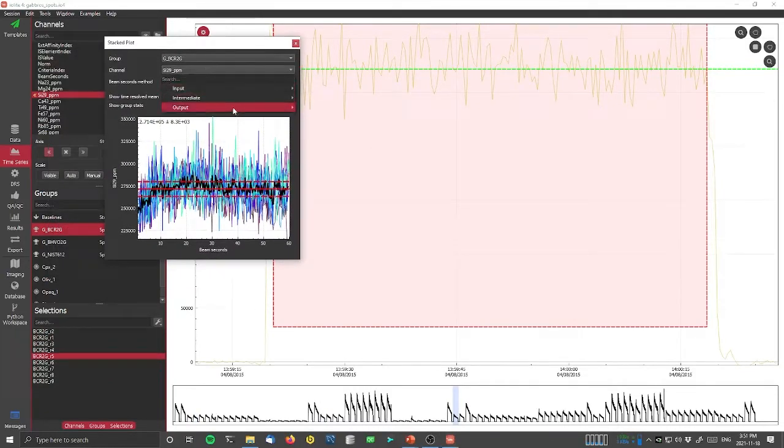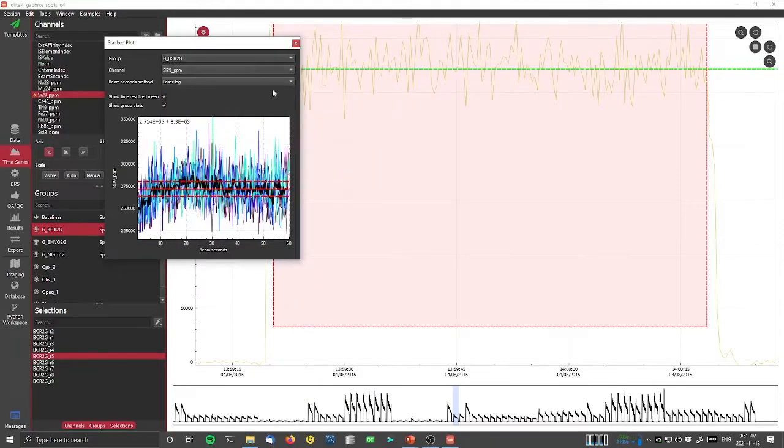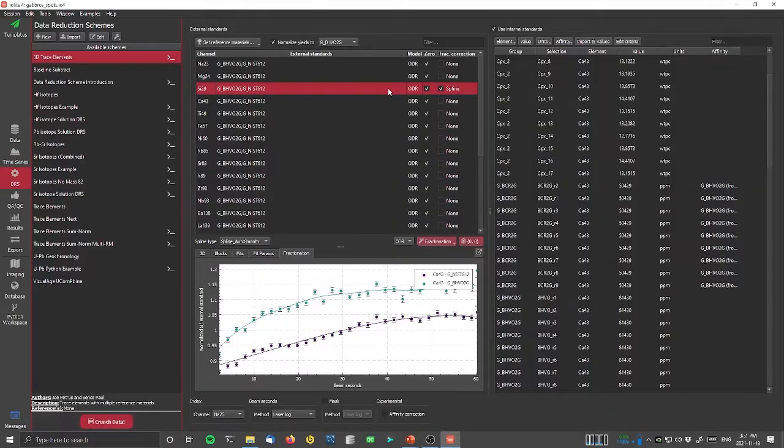So I'm just going to double check that I'm checking the right channel again. And we can also go back and check this value. Just checking my results here.